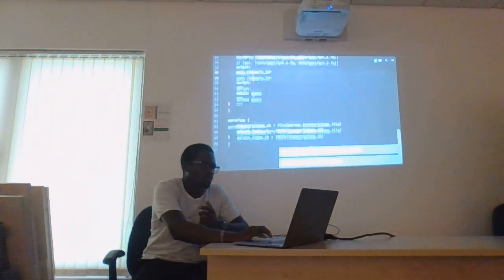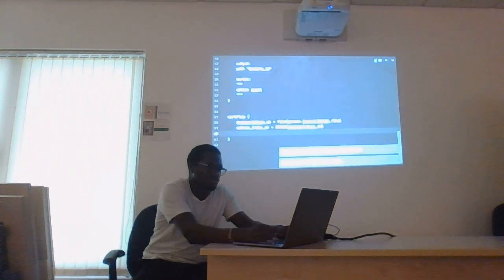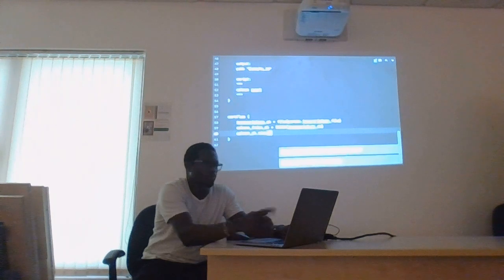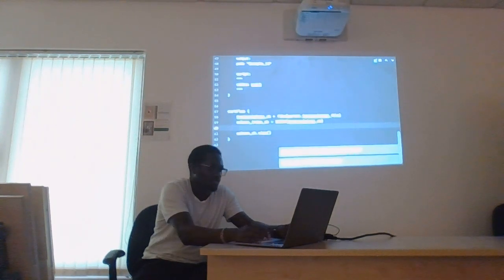And if you want to view a channel, for instance, you can just use print and .view, and it will show me that it is a file. So the channel for the reads would be something like this. Would be channel.